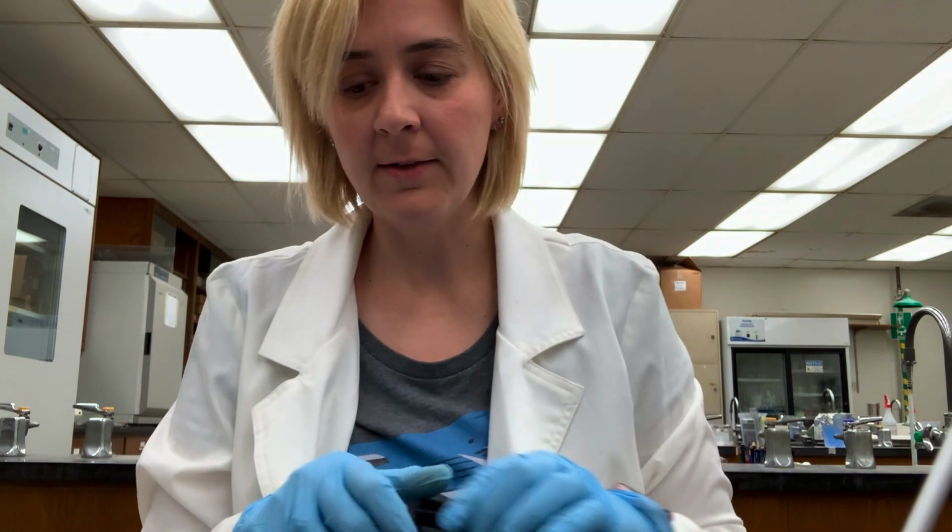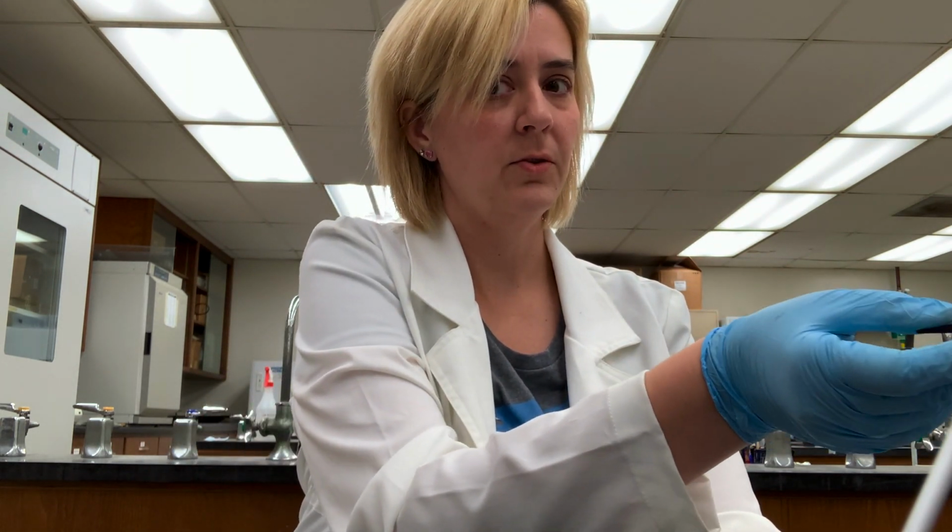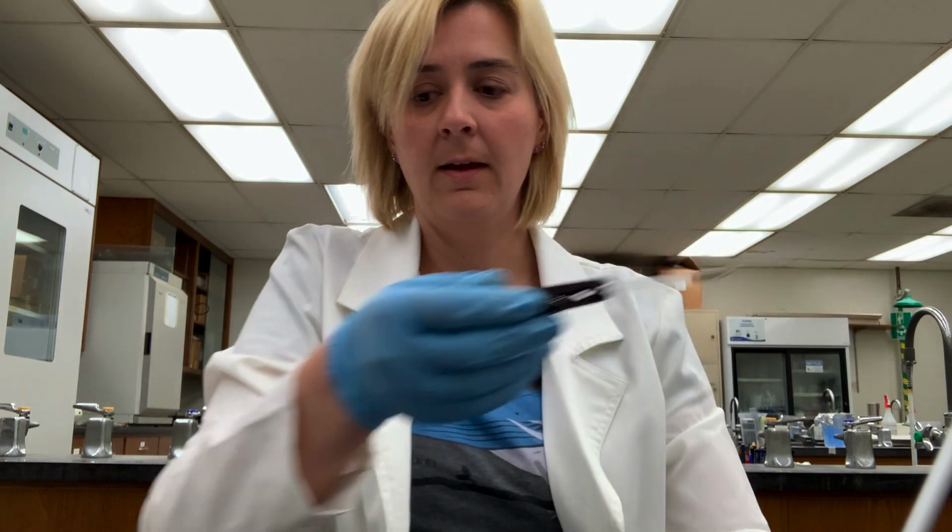It looks like I have air dried pretty well, so I'm going to go ahead and heat fix by passing through the Bunsen burner. Remember, just a couple of times. 1, 2, 3. Gonna go ahead and put that on the slide rack.